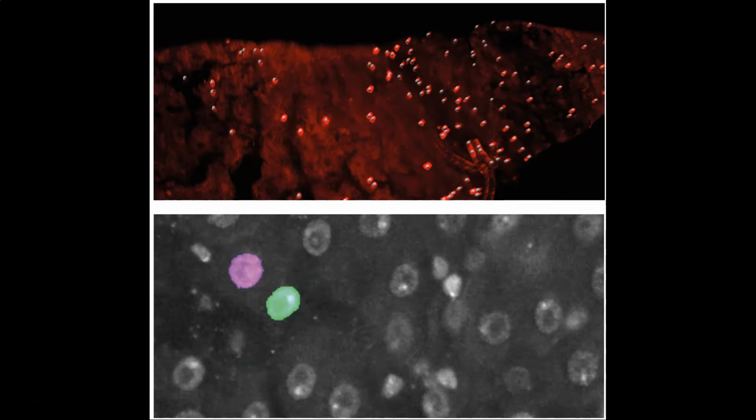For object detection, we have used Imaris and its spot detection algorithm to segment nuclei from midgut images. However, other object detection algorithms can be used as well, as long as you can provide object coordinates for LAM. Following object detection, the obtained data must be organized in order to use LAM.